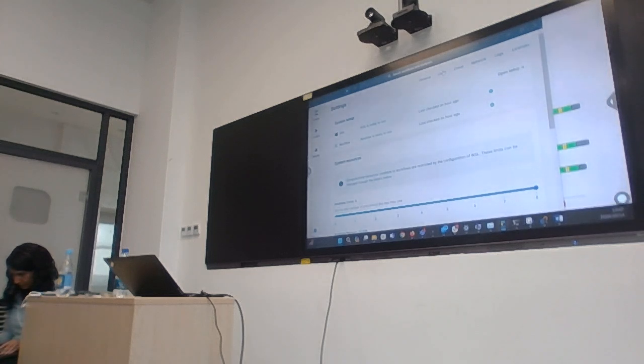Can you log out and log back in again? Okay. But we just did the reboot, didn't we? Okay, let's try and reboot again.